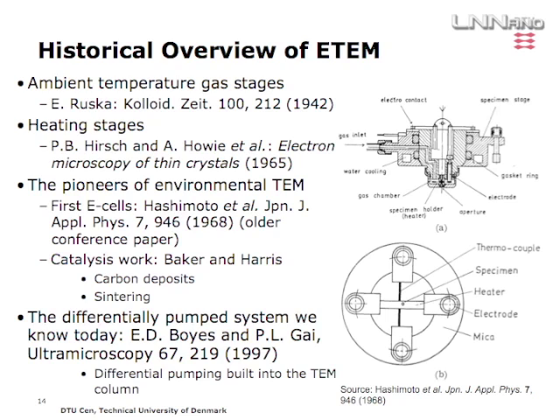And you can do heating as well; this is just joule heating. Then you have a thermocouple the other way to measure the temperature. This kind of setup was used heavily by Baker and Harris in the 70s and 80s to study carbon deposits and sintering of nanoparticles.